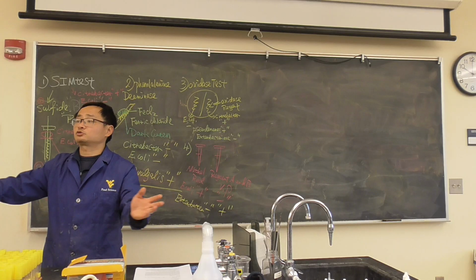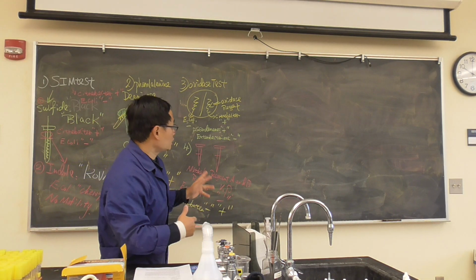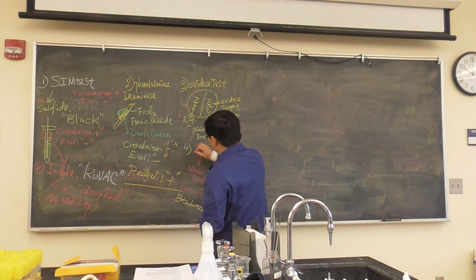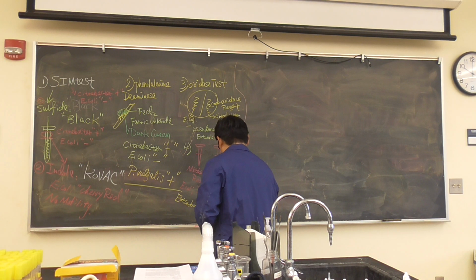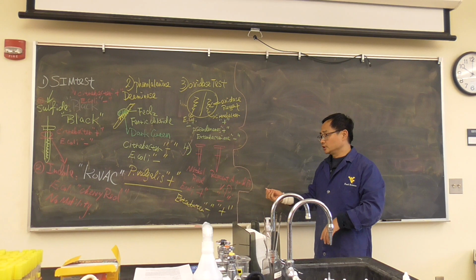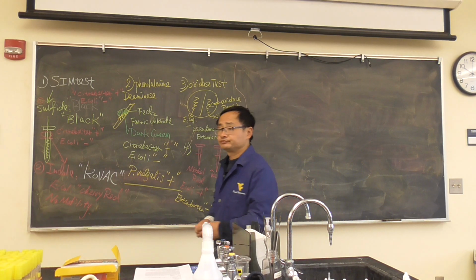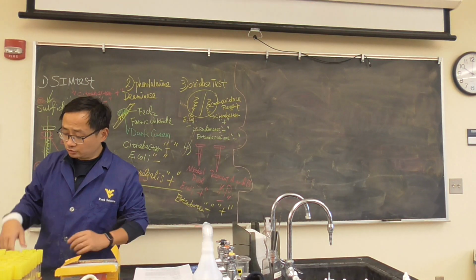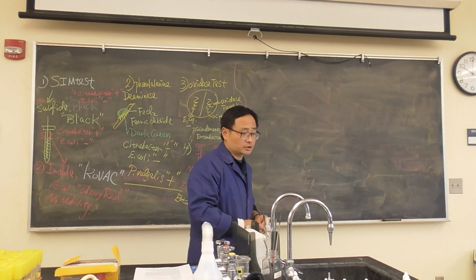4 of you as a group, just do a demonstration. 2 of you as a group, just do a demonstration. Okay? Because today's other work is relatively simple. So this test, you could do it later on by yourself. The results I already told you. And the VP, you have to incubate a little bit. You can put it on your tray in the rack, wait for Thursday to see whether there's a color change. Okay, I suggest one bench, have 2 people do it. Then show the other students on Thursday what it looks like. Methyl red you can see immediately.